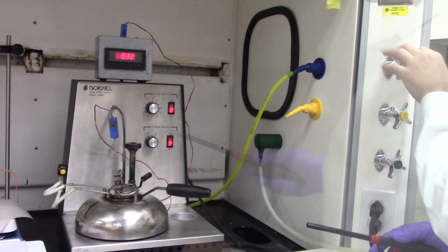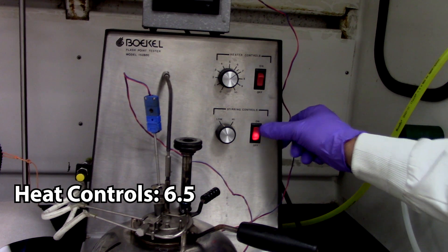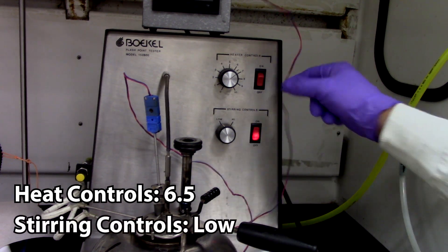The blue gas valve is then turned on and the flame is lit. After, the heat controls are set to 6.5 and the stirring controls to low, and these are turned on.